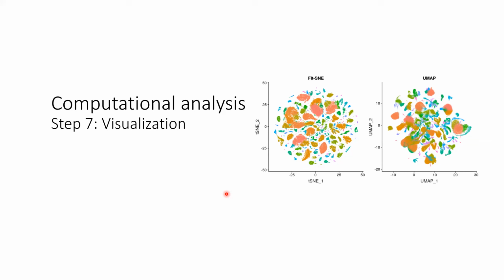Sorry, could you repeat that last sentence you said? Oh, so we did an experiment where we measured how much distortion was introduced into the neighborhood structure, which I will talk about a lot more right now. So the idea is comparing the cell neighbors in high dimensional space to the cell neighbors in the low dimensional PCA space to see whether or not the neighborhood structure is preserved after you reduce the dimensions using PCA.